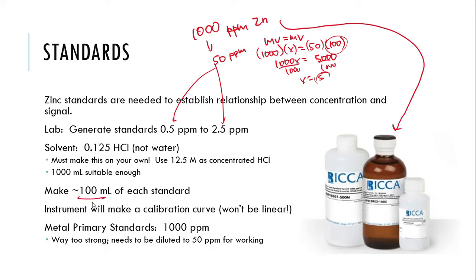It will lay out what you need to pipette. It will tell you how to prepare those standards and how to get them ready. It is just simply the fact of how do you dilute your own pill to make sure that it works between 0.5 to 2.5 ppm. That's what we're after. And folks, that really depends. It depends on the pill that you get. It depends on the milligram that's stated on the label. So everyone's will not be the same. So you just want to pay attention to the label statement once more.